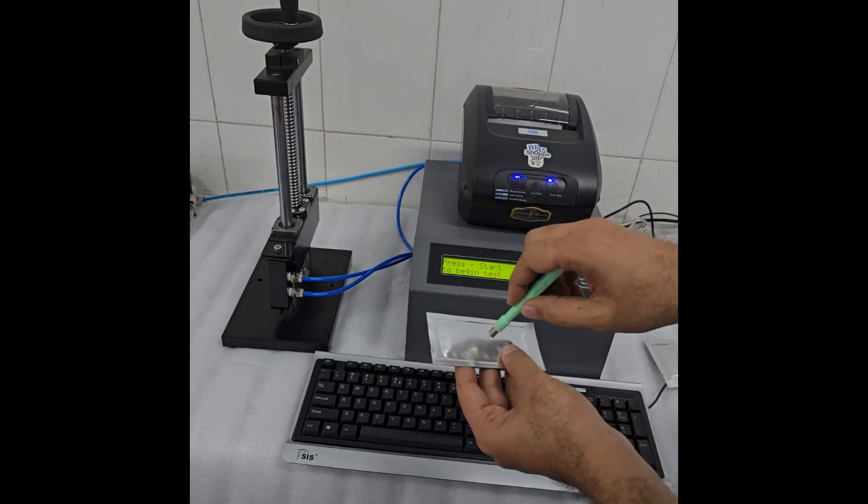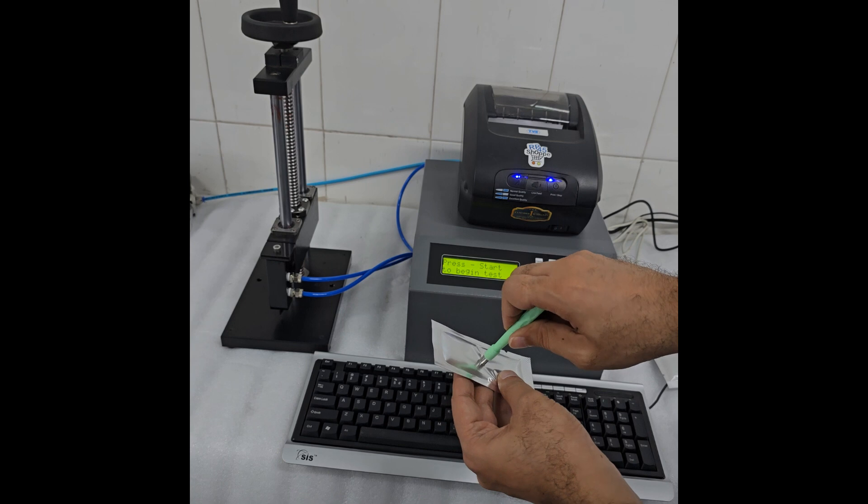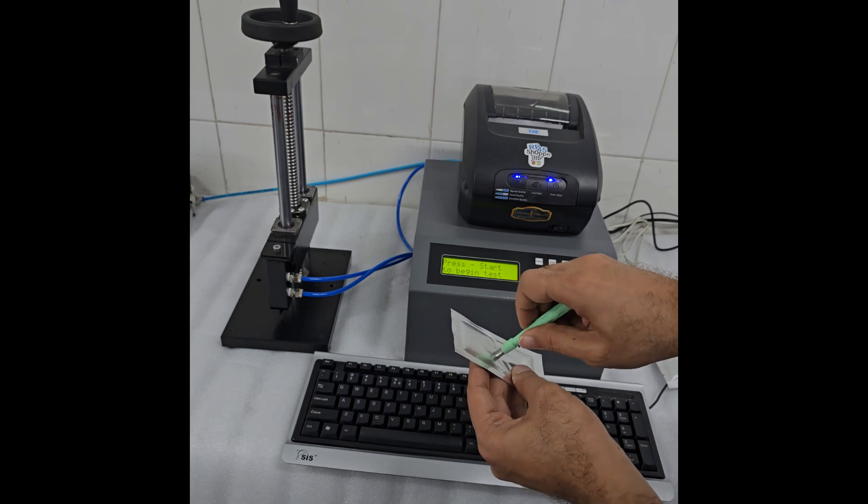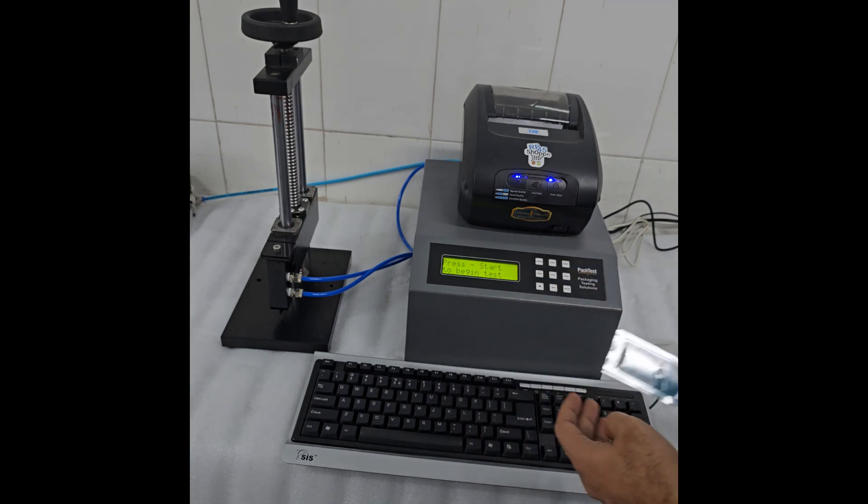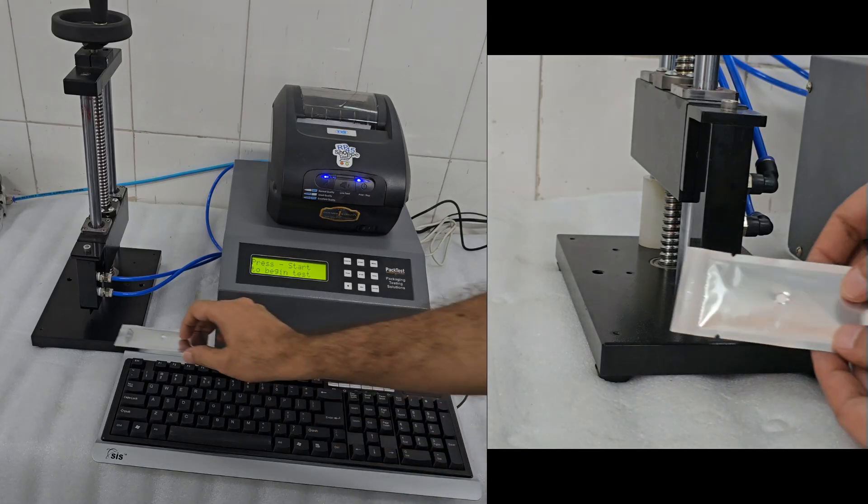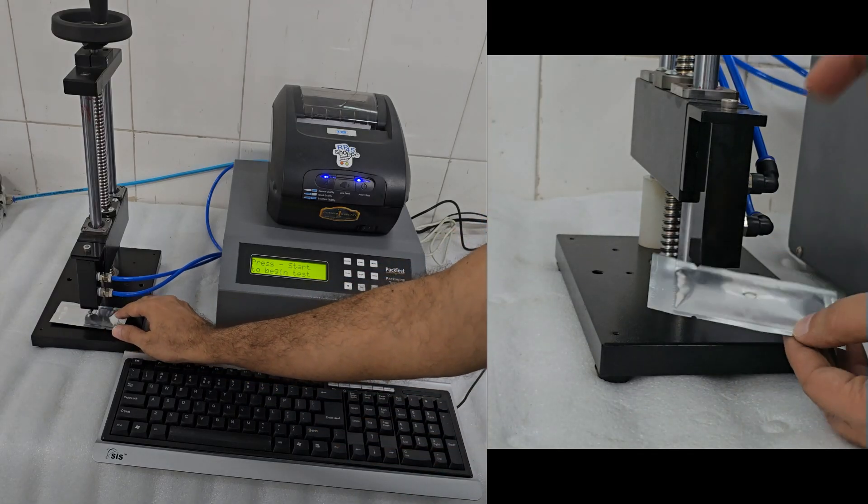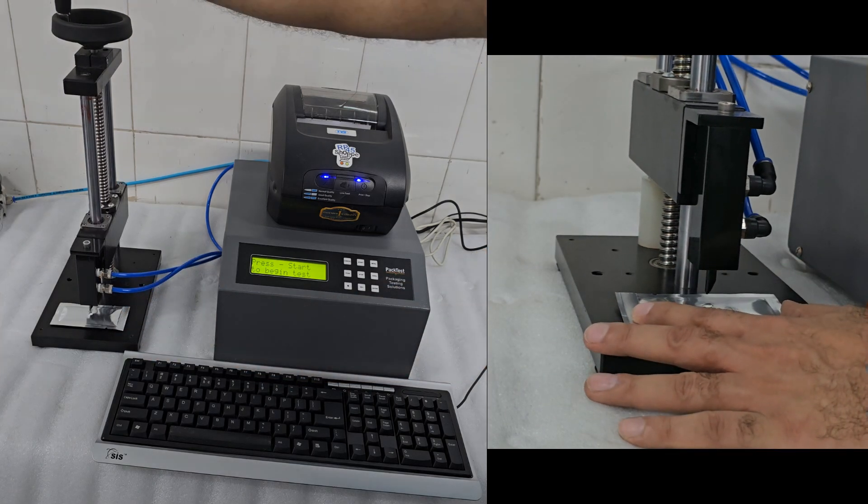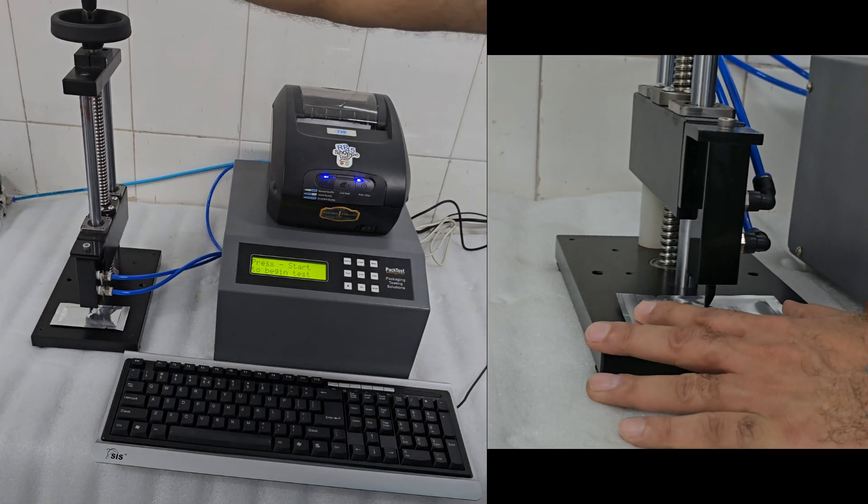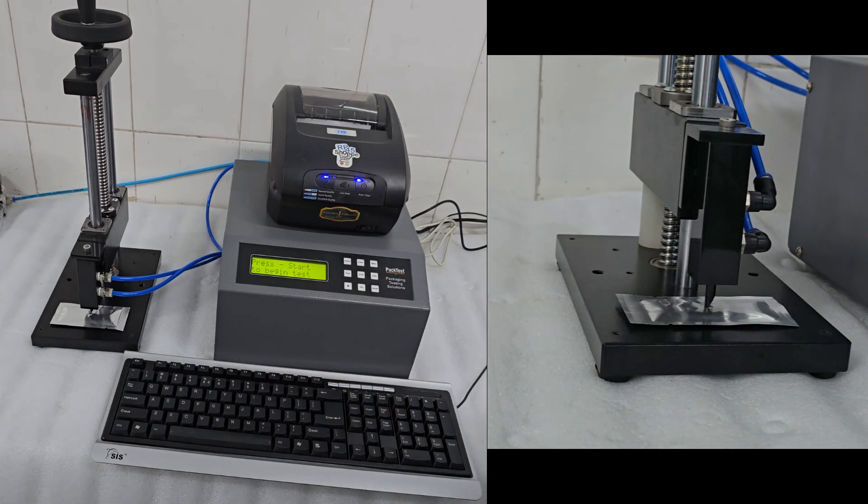Use a biopsy punch to cut a clean hole on one side of the pouch face. Now place the pouch in the test stand. Place the pouch right under the nozzle and bring the probe down, such that the nozzle just about enters the pouch body.